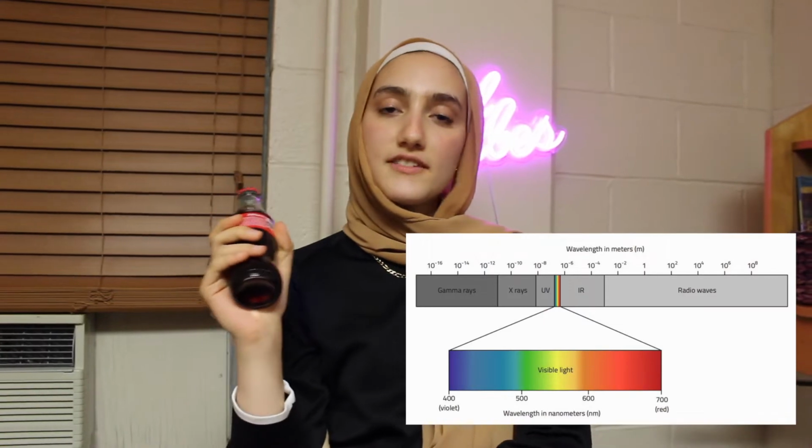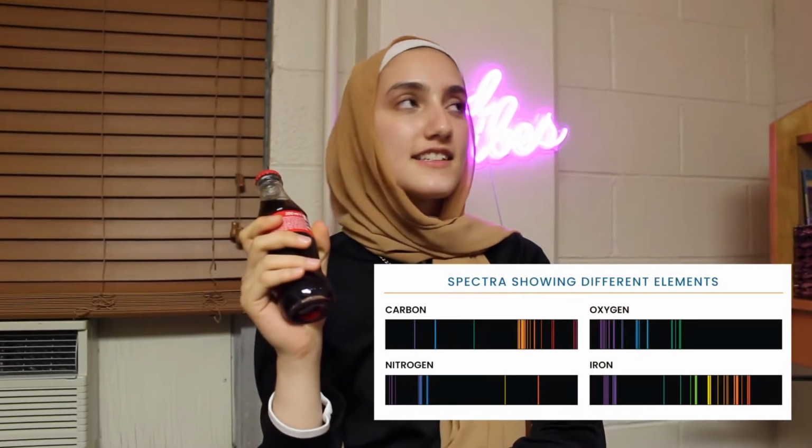A spectroscope is used to emit the different colors of light in the visible light and show the different wavelengths with different intensities and brightnesses. A spectroscope allows scientists to know what actually makes up a sample, molecularly and structurally.